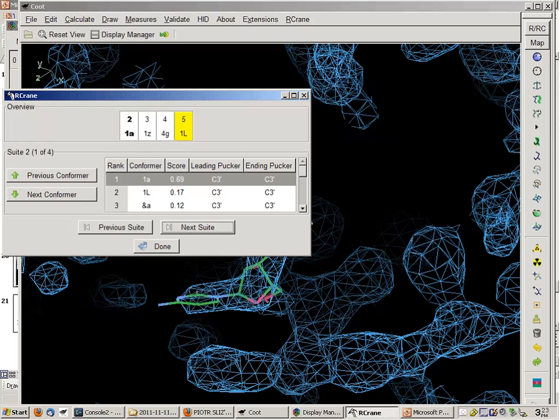For the most part, I've tested a handful of maps, and the parameters seem to work fairly well. If anybody has trouble with them, they're certainly more than welcome to email me and let me know what's happening. I can try to fix it and try to play with weights and see if there's anything I can do to get things working.